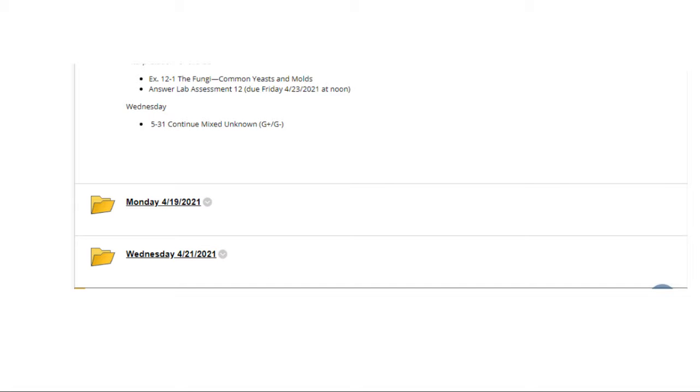So the way we are going to go about this today is as if I was a student that had an unknown, and I'm going to use the exact same code of the unknown that I've been using, which is IR. This is my unknown, nobody else's but mine. So that first week, that was the code that I received, and every week that there was a new folder, I opened that folder and I collected results.